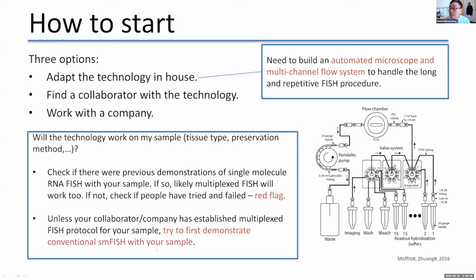All right, so you have your sample, you even have a FISH protocol, and there we have the published protocol, for example. What you need is a probe set that targets your RNAs of interest to try first. This is a conventional single molecule FISH.